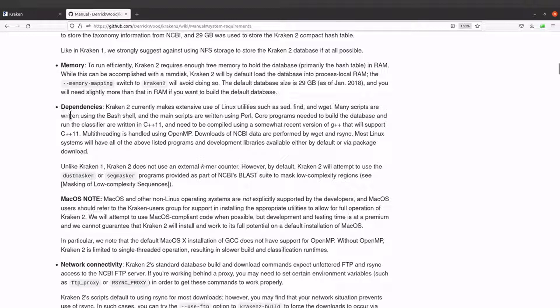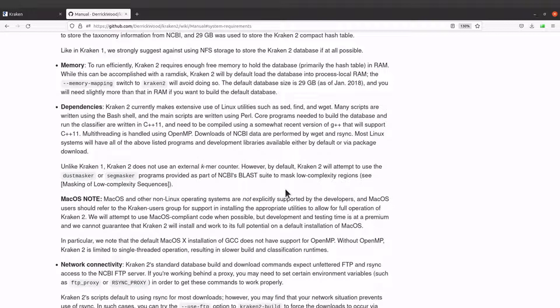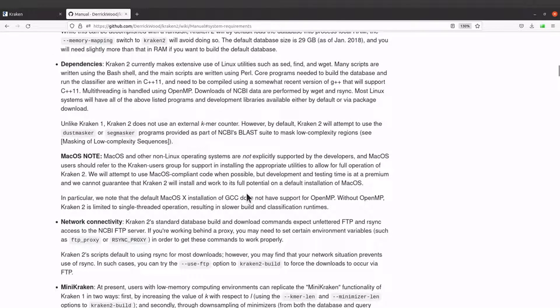Let's move to the dependencies — this is what we need to check when installing Kraken. Kraken makes extensive use of Linux utilities, so you need to have Linux. You also need to have some programs available, for example Perl, and you should also have OpenMP. If you have challenges with setting up your PC with respect to these dependencies, you can contact me and we can look at how to resolve that issue.